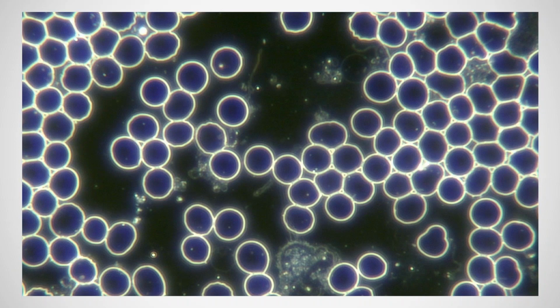Right, and just another example of some pleomorphic patterns here. What's quite interesting at the bottom of the image here, this white blood cell looks like a monocyte, and we have some of these extensions from the white blood cell as well. So also some white blood cell parasitism. This tube-like structure towards the center of the image is actually an ascus. Asci we are going to be covering in the course, and there's also a longer ascus visible towards the top of the image here as well.